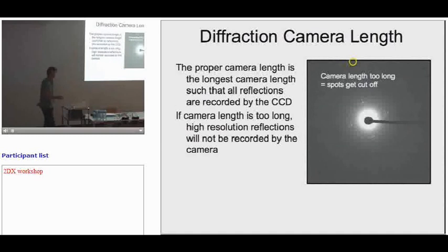I keep everything aligned and I blank it, and then I unblank it quickly and then blank it again so that, with the lights off, you can see the outline of the diffraction spot around the beam stop. What I'm asking is, which do you move? Do you move the beam stop, or if it's off, I'll go back and switch back to search mode, move to another area, and realign everything.